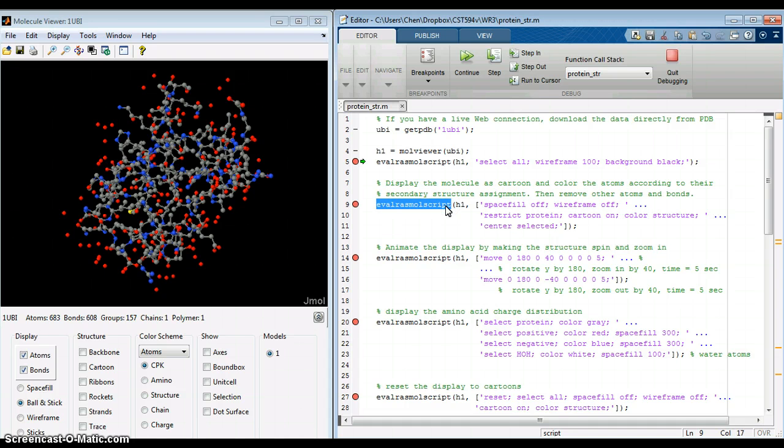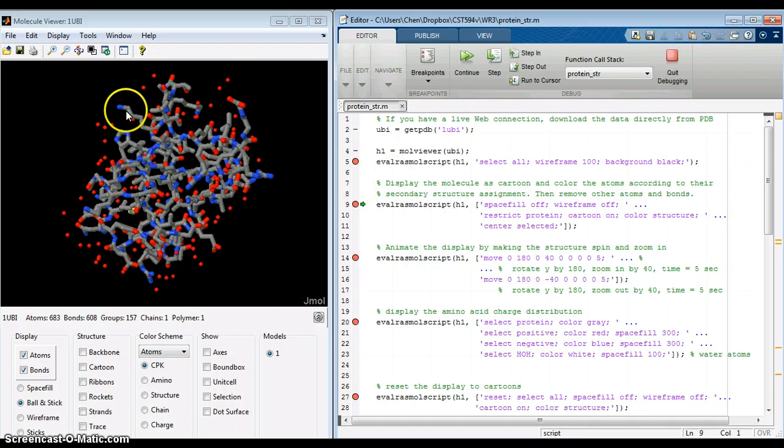This function is just like an on-call subroutine that holds the protein structure characteristic information with all the parameter setting modifications. So let's do the first one. The first one is I want to enlarge the connecting bonds. So now you can see all the connecting bonds are enlarged.